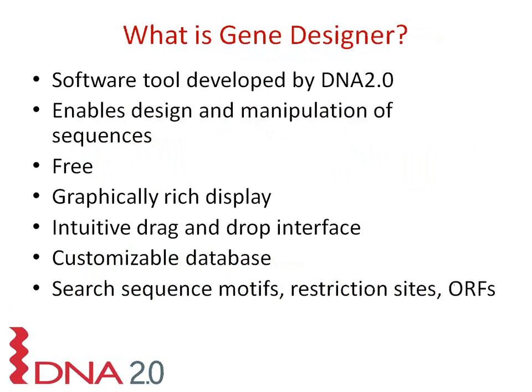So what is Gene Designer? It's a software tool that was developed by DNA 2.0, which allows you to design and manipulate sequences with ease. The software is free, has a graphically rich display with drag and drop features, making it easy to design genes, a customizable database of commonly used elements, and you can do sequence analysis, look for sequence motifs, restriction sites, ORFs, etc.